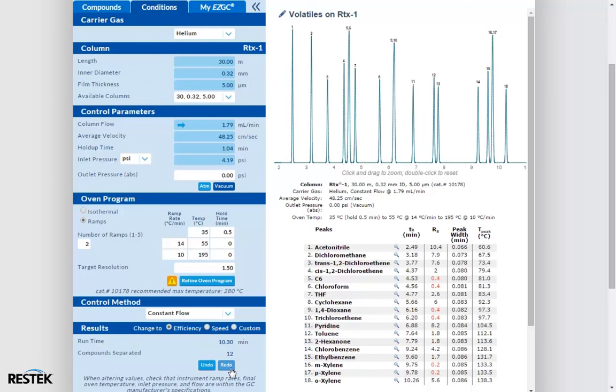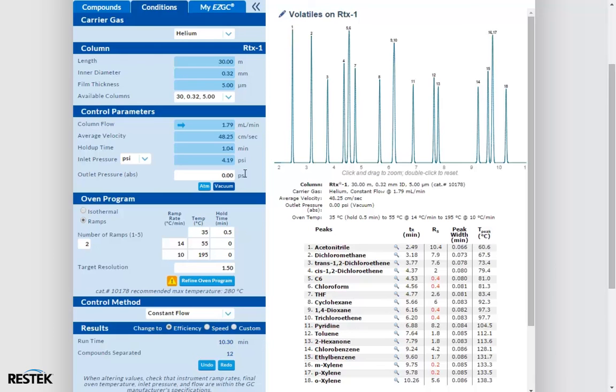Because we're not in custom mode, our flow parameters are locked by the software. We can definitely change these if we want, but in my experience, the software does a pretty good job by itself most of the time. Just remember, whenever you change column flows or linear velocities, elution temperatures are changed, which may either improve or degrade your separation. Use the refine button to see if you have any better options any time you change elution temperatures.